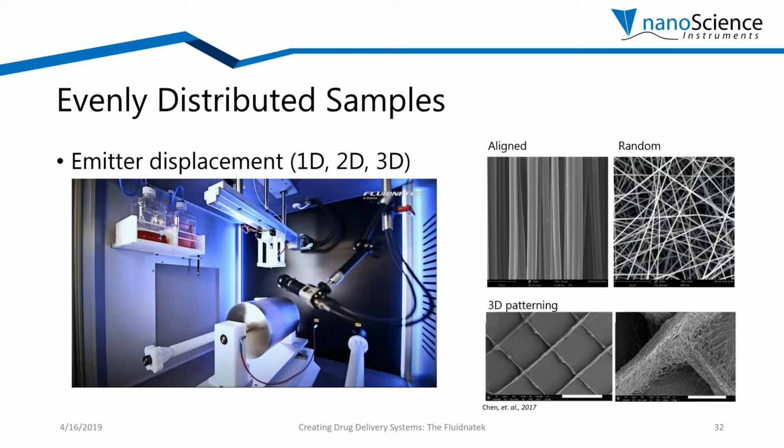Meanwhile, similar to 3D printing, our electrospinning units can create this beautiful 3D patterning scaffold. From far away, it looks like only one big fiber, but if you look closely, you can see this really interesting pattern of really small fibers in the actual main sample. And then here we're looking at the microstructure of aligned and random fibers also.